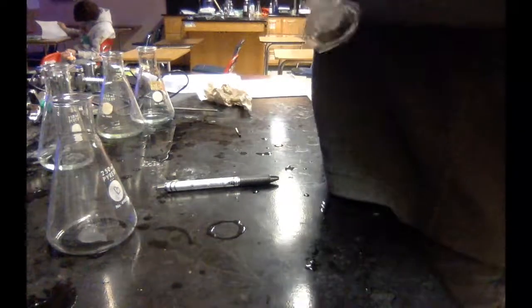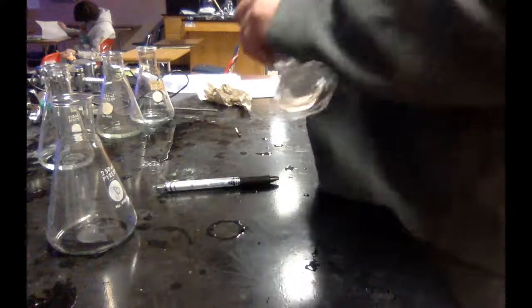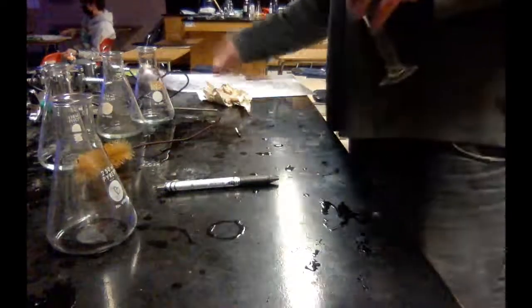In a 250 milliliter beaker, 400... We're thinking. We're not just reading directions, right? So go to data table 1 again, and add up how much thiosulfate we need.